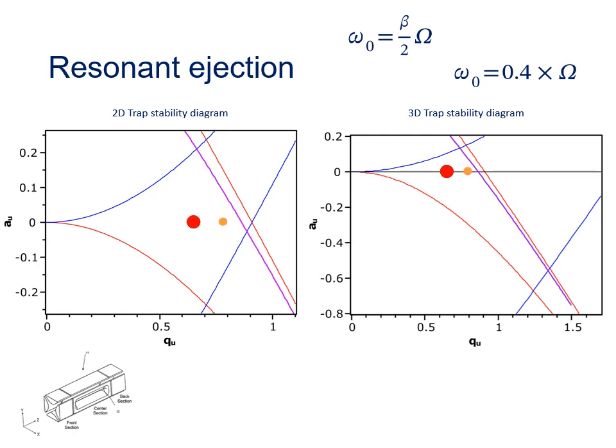And then, as each subsequent ion also reaches that resonant frequency, they too get ejected out of the trap and into the detector. So in this mode of operation, ions never reach the boundary of the stability region. Now there are two key benefits to this resonant ejection approach. The first one of these affects only linear ion traps.